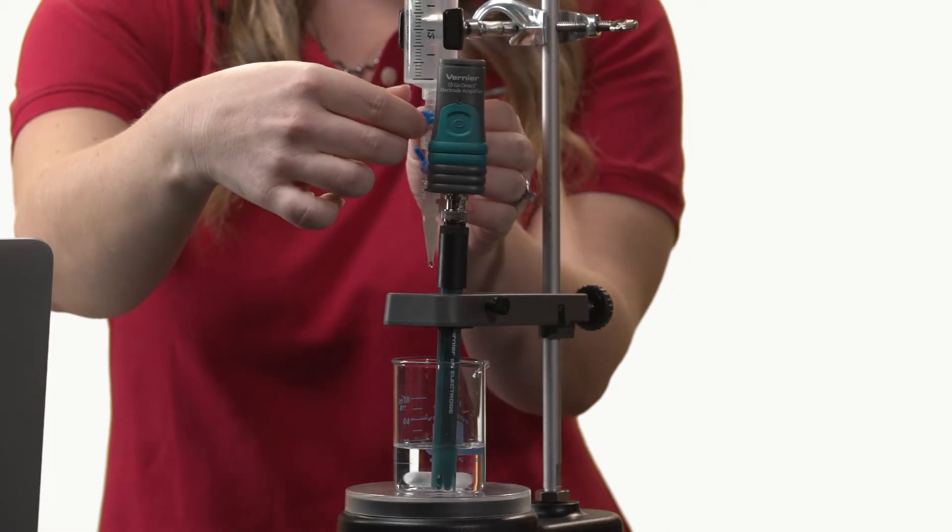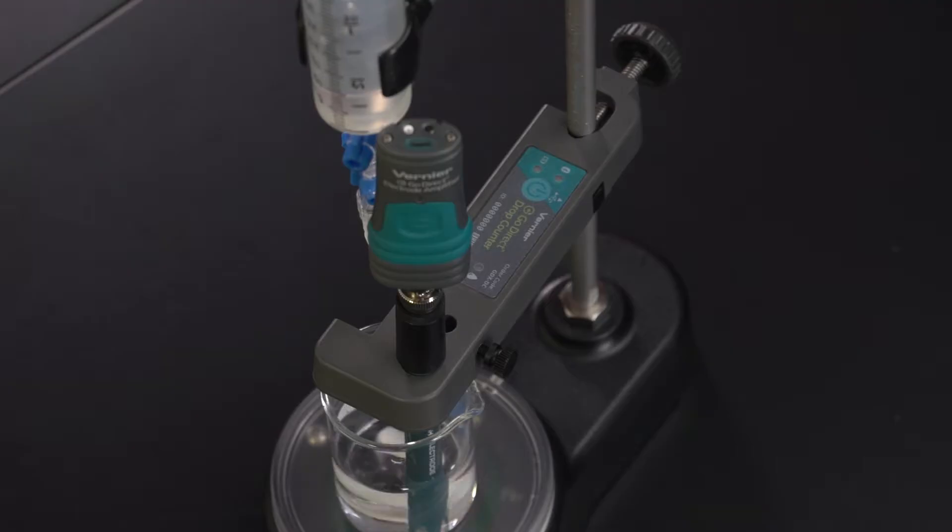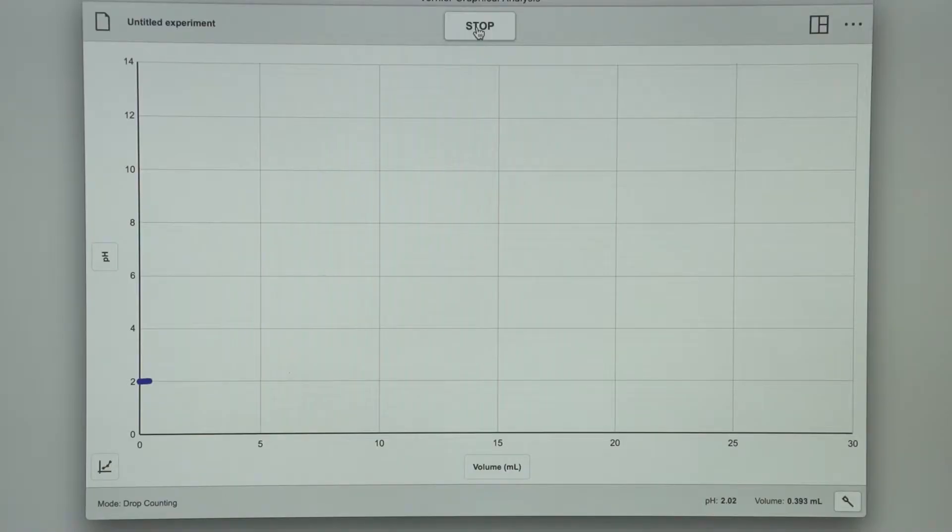At this point, I can open the stopcock on my reagent reservoir, and the drops will go through the slot, and I see the indication of that on the drop counter and on the software.